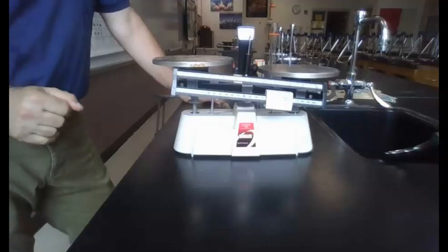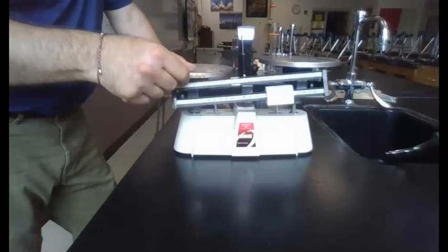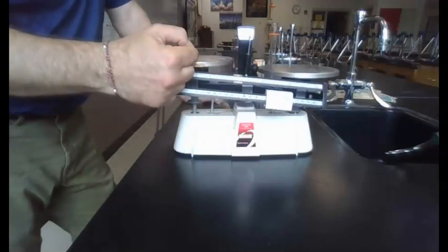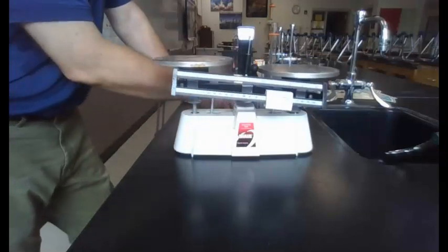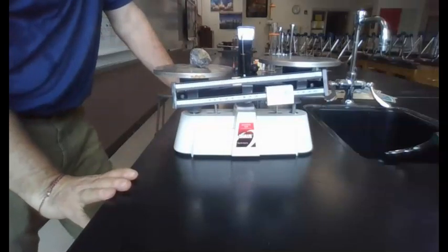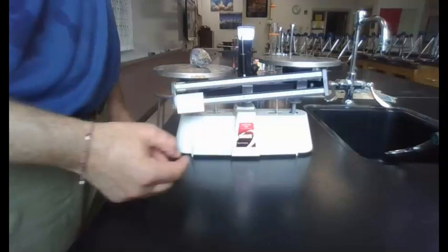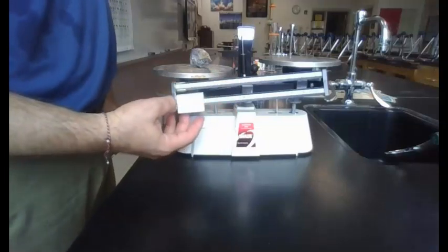Now the third type of scale you might come across is kind of like this. It's a balance that has 2 plates on it. The plate on the left is the one where you're going to place your sample to be weighed. Now, just like before, weights start out at 0. And see, this one only has 2 beams.